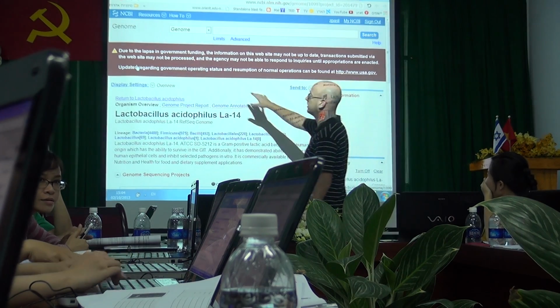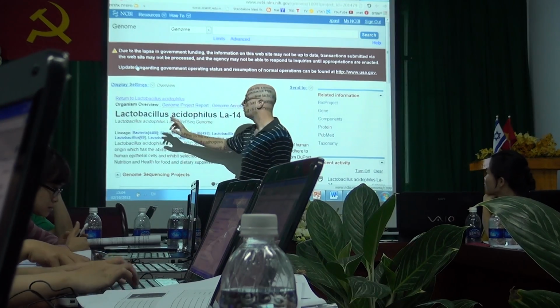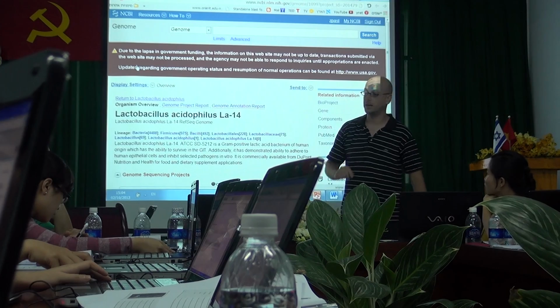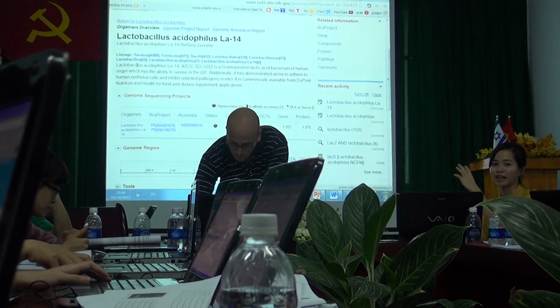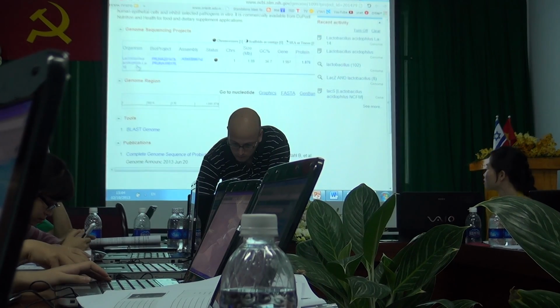And now we are still in the genome database. But now we are at the page dedicated to Lactobacillus acidophilus LA14. Mình vẫn ở trong cái cơ sở dữ liệu sinh nhân, nhưng mình đang ở trong cái trang của cái dòng Lactobacillus đó. Right.